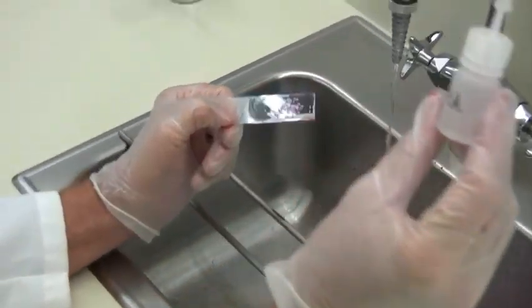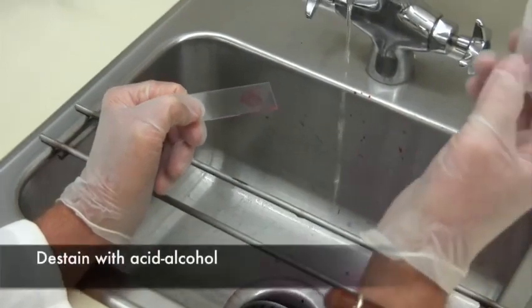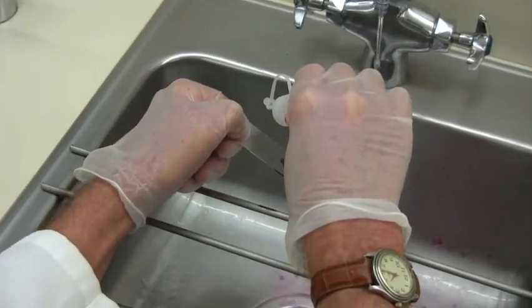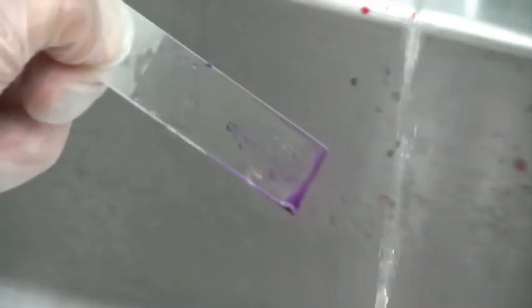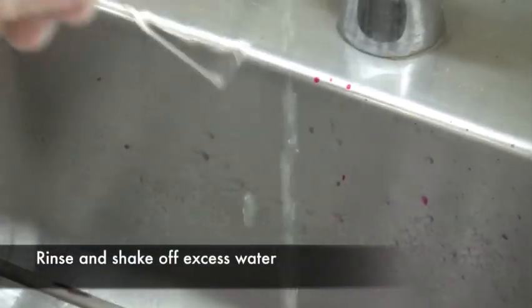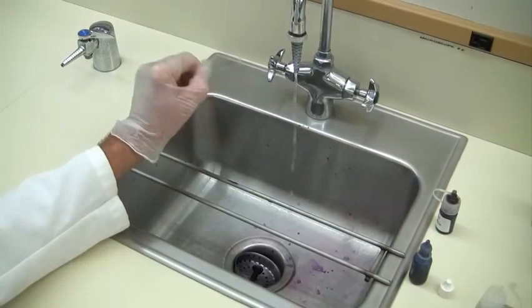Then you want to use acid alcohol for a destaining step, and you just add it drop by drop until the pink or the purple stops running from the smear. And it looks like it's going to take 6 or 7 drops maybe in this case. Then you want to rinse the slide immediately again. Shake off the excess water.